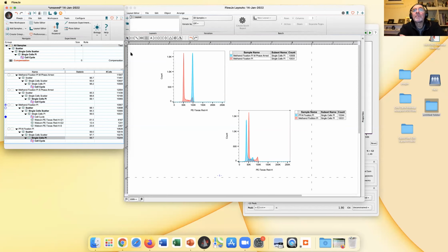Well, there was one that I sort of answered in chat about how can you differentiate cells that have doubled their genome, so cells that become tetraploid, to cells that are in G2. And we can't really do that just by using a DNA dye. We would have to add something else in there as well. But the DNA analysis can lead you down that path as to what to do.